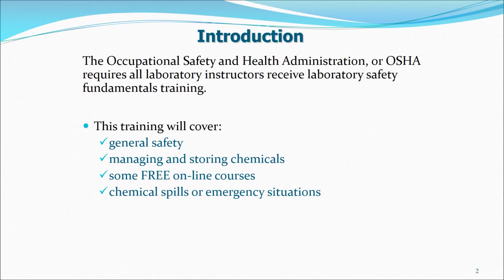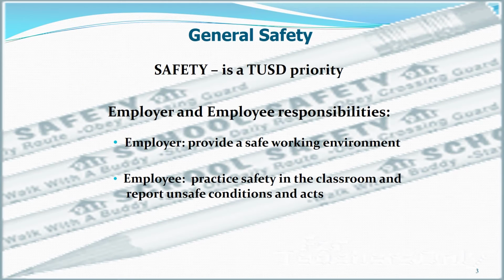Science is a process of discovering and exploring the natural world through classroom lecture and experiments. As part of your science class, you will be doing many activities and investigations that will involve the use of various materials, equipment, and chemicals. At TUSD, safety is a priority. It is divided into both the employer and employee responsibilities. The employer is responsible to provide a safe working environment, and the employee is responsible to report any unsafe conditions or acts they see. Remember, this lab safety and chemical hygiene plan is only a source of information. You're the one who has to put the knowledge it gives you to work. The ultimate responsibility to be safe is with you.